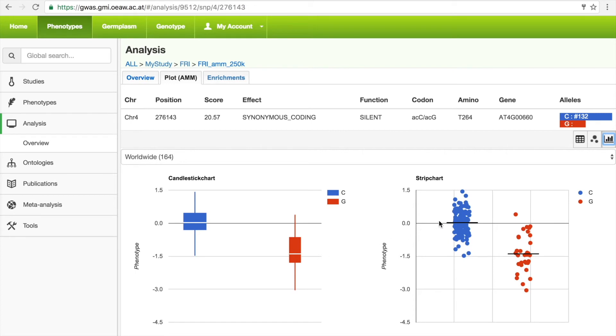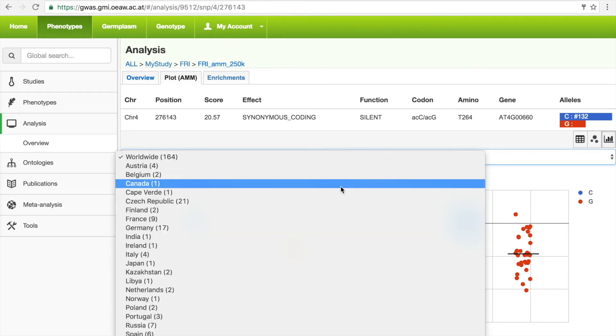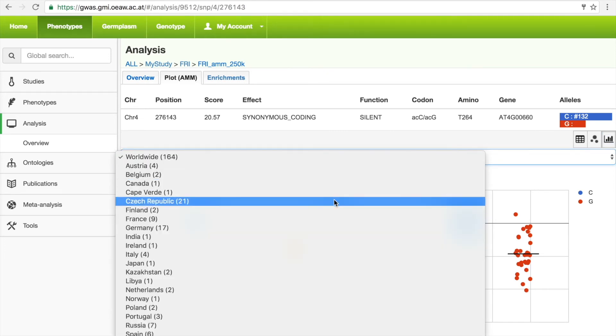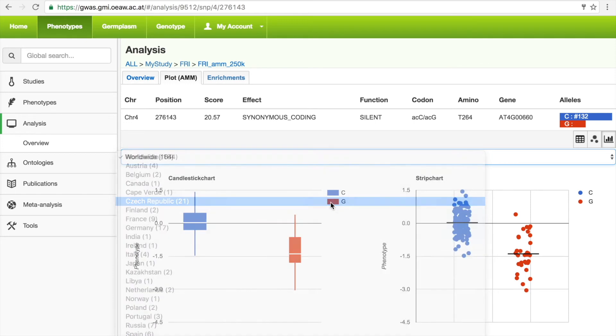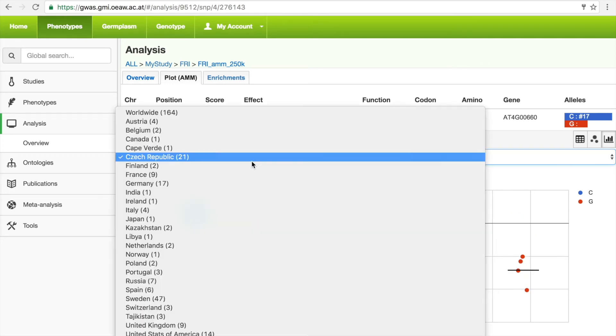By default, all phenotype samples are displayed, but because we have the meta information, we can see how many samples come from different countries and subset the data, for example, by only visualizing ecotypes from the Czech Republic or the United States.